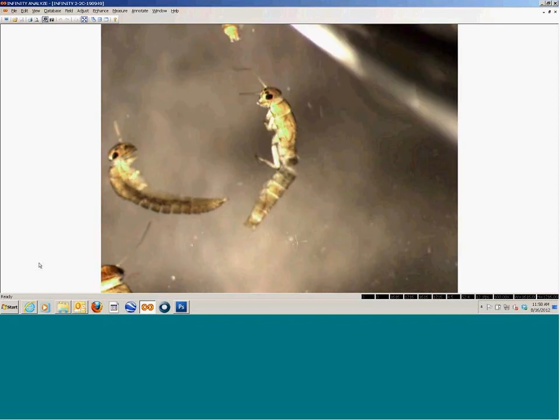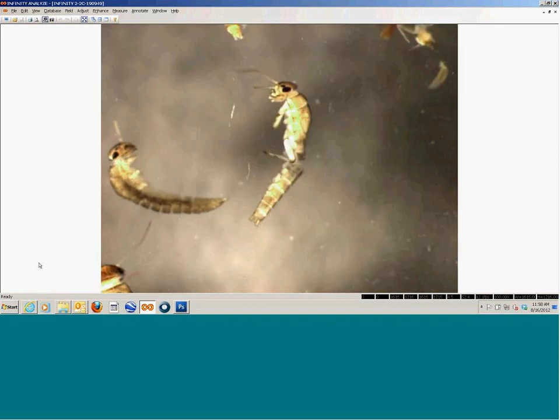And the obvious answer is if it's mature and it doesn't have gills, you have to leave it at Baetis too.